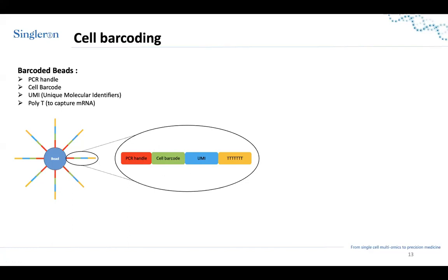And we don't count them in the analysis. What is important is to identify the unique UMIs or unique mRNAs that came from the gene to have a better estimation of the gene expression level. So this is basically how it starts, the bead capture and the introduction of the cell barcode.